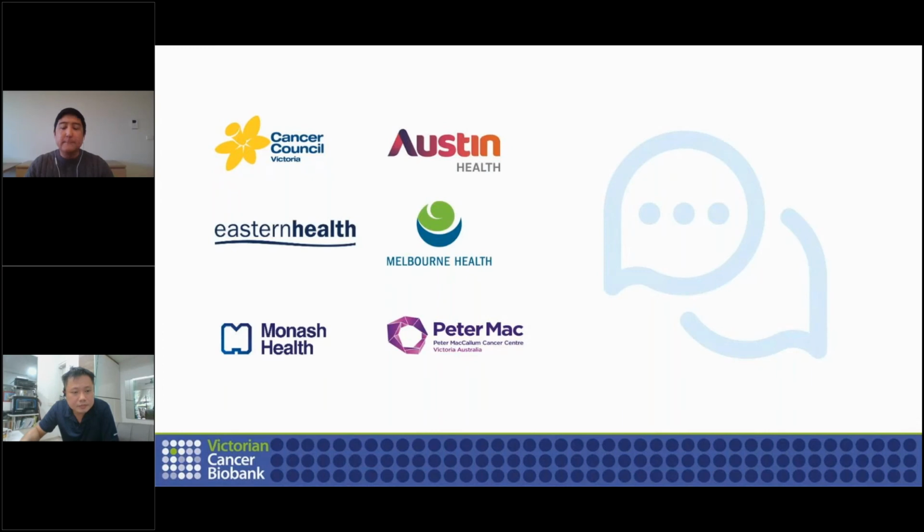Clinical trial support. All right. Yes. In terms of the VCB, our clinical trial support is just blood processing. We don't, in a traditional sense, provide access to an external user or create collection protocols with them at different time points. We just process the bloods, supporting clinical trials. So it's mainly processing. There is no storage of clinical information, treatment data, or inventory information. So it's purely a fee-for-service processing service. At this stage, yes, for clinical trials. We do capture clinical data for archival collections, though.